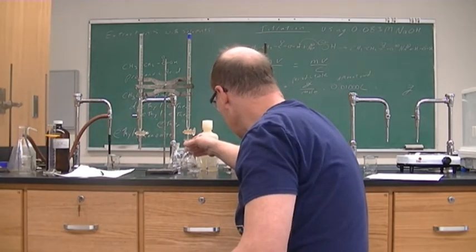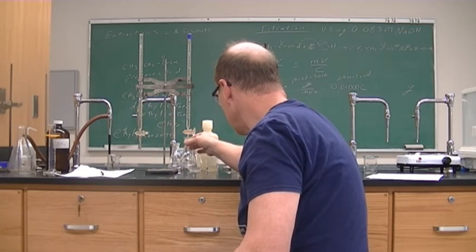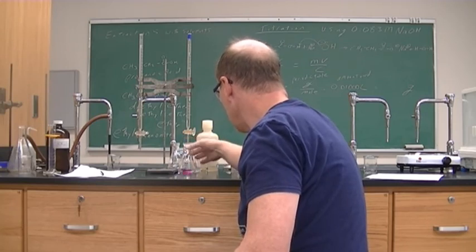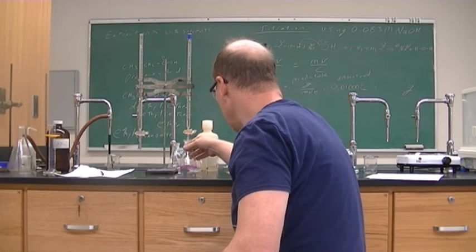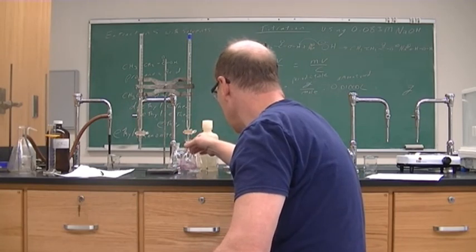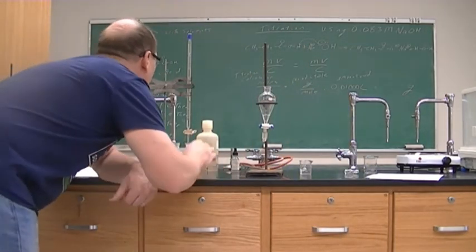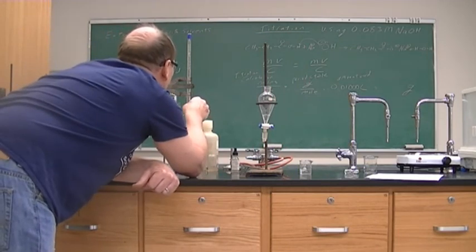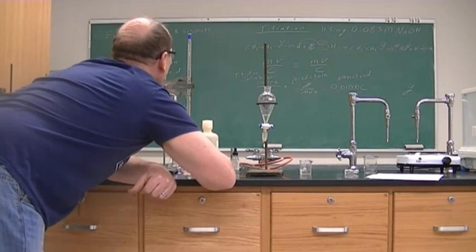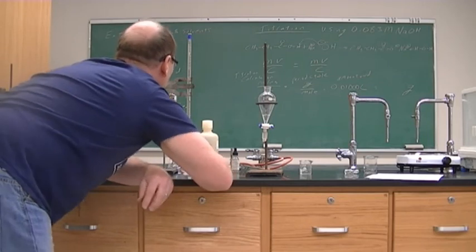It's lingering. It's getting close. All right, it is still pink, and that is our endpoint. And we are at .50 milliliters.